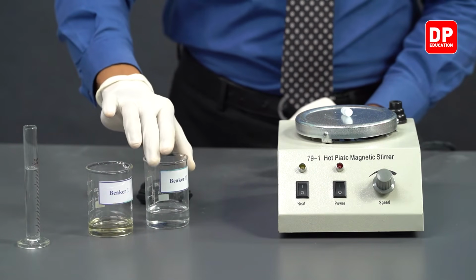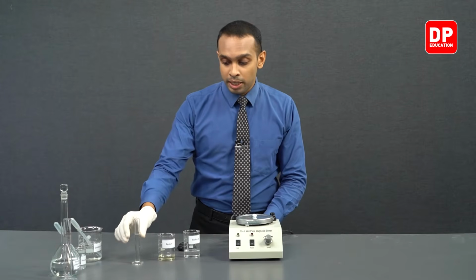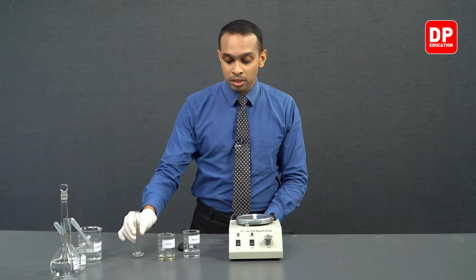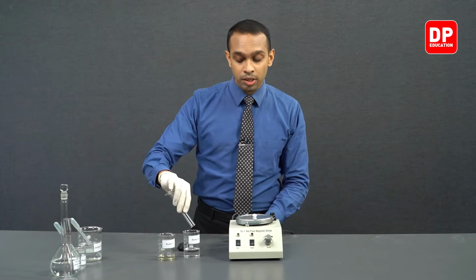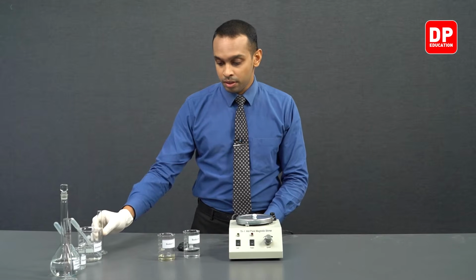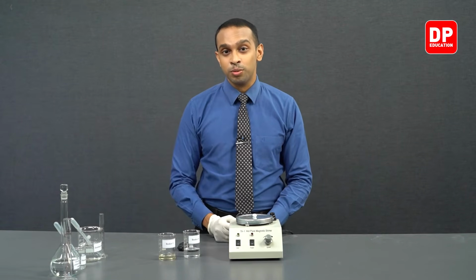So the overall volume in beaker 2 right now is 25 cubic centimeters. And if you add this 10 cubic centimeters of water into beaker 2, now the volume is 35 cubic centimeters. So 35 plus 15 is 50 cubic centimeters.